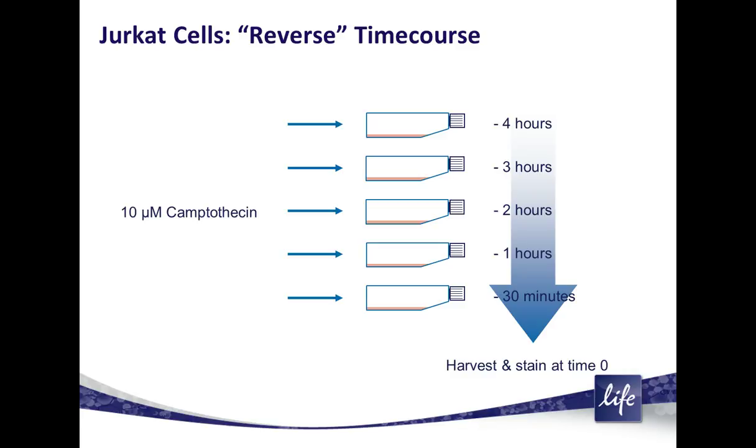This just illustrates that doing a reverse time course allows you to harvest at the same time and then put them into the same experiments.